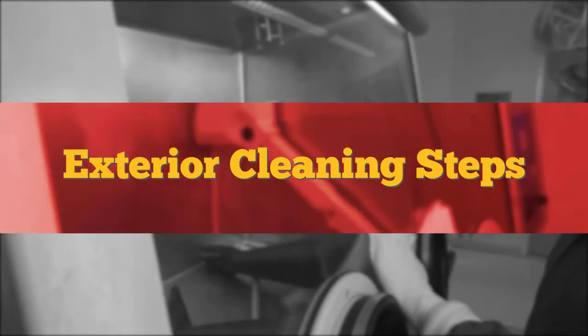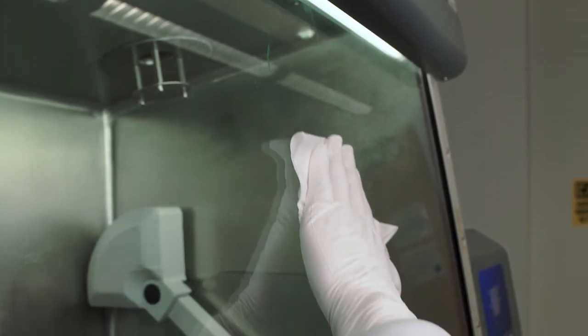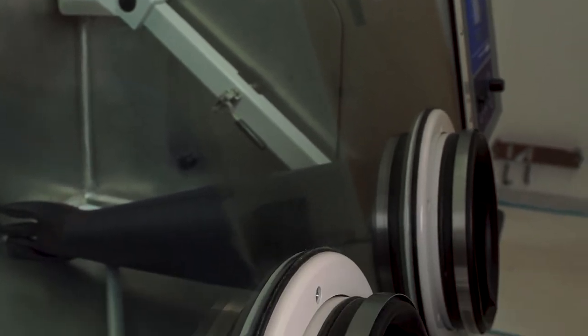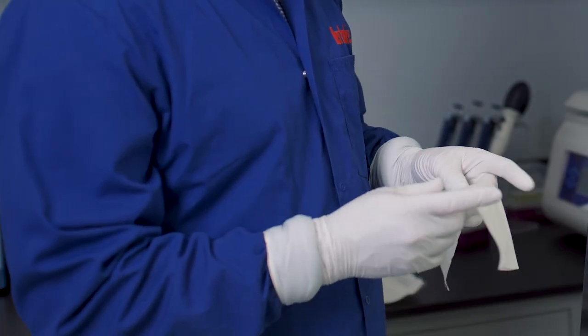Exterior cleaning steps. Use pre-saturated, non-sterile isopropyl alcohol and deionized water wipes, starting top to bottom, finishing with the front shield. Remember to quarter-fold the wipe, exposing a clean surface each time.